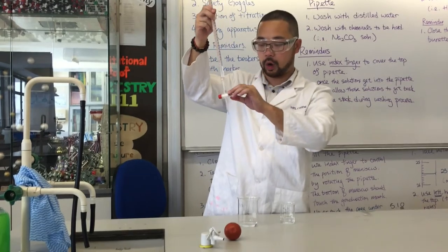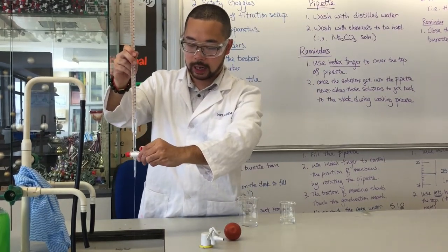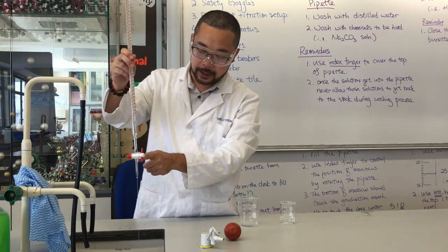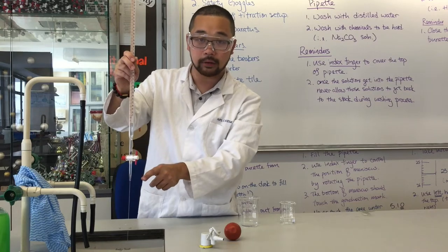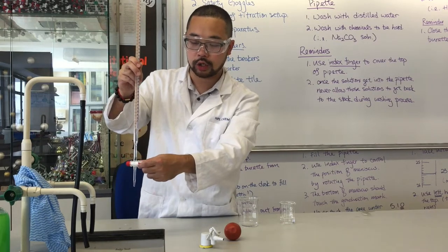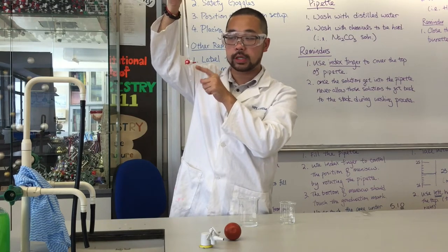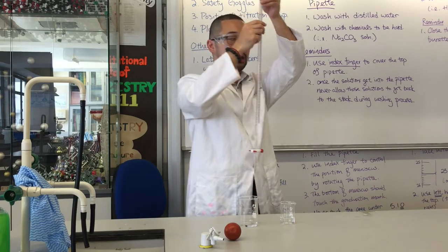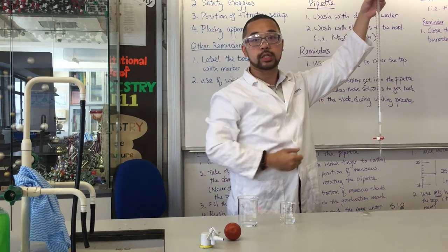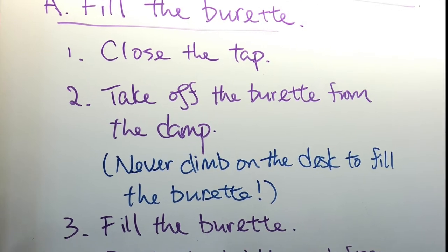How to do that? Get close to the sink, open the tap and let the liquid come out. If you find bubbles here, just shake it a bit, and the bubbles will normally come out. After that, close the tap and check it one more time. When you see there are no bubbles, this burette is well filled. Then just clamp it back onto the standing clamp.